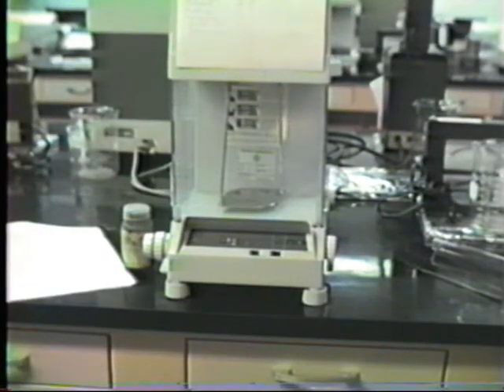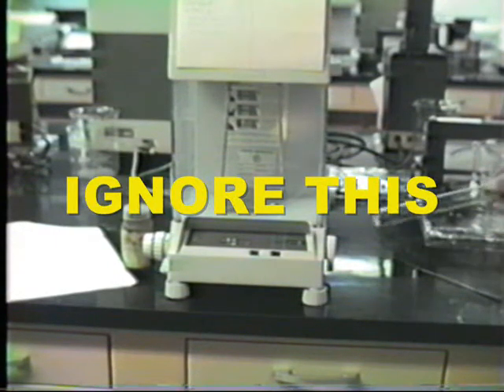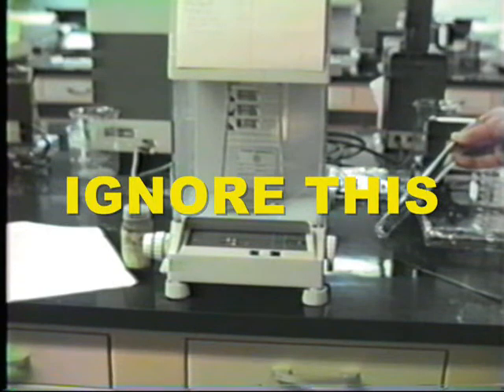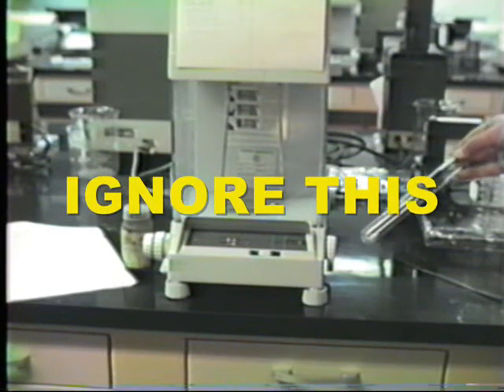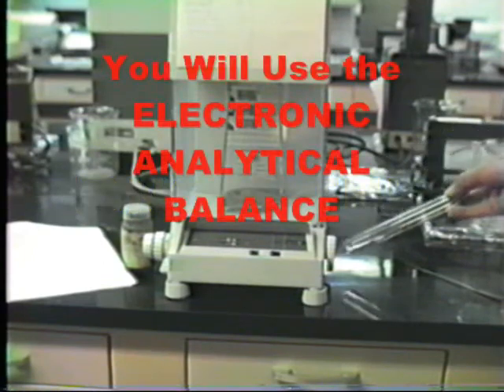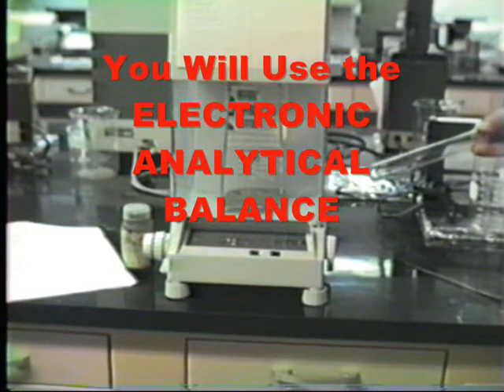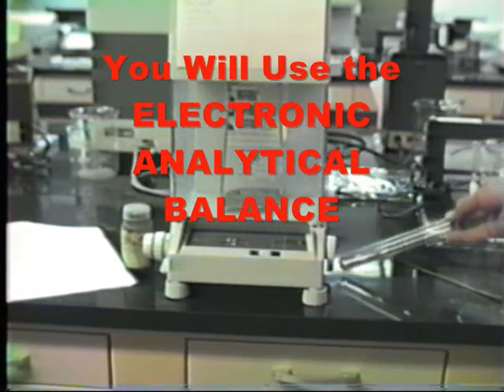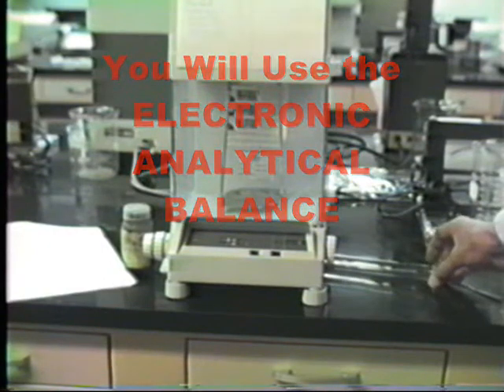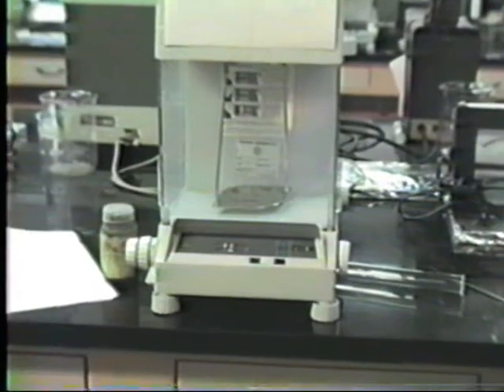We won't go over all the details, but there are a couple of words of caution. Please use the same balance for all 4 weighings in a test tube. As you put material in or you weigh the thing after it's heated, use the same balance for all those 4 weighings. If you want, you can use another balance for your second test tube, but use that balance for all the 4 weighings.